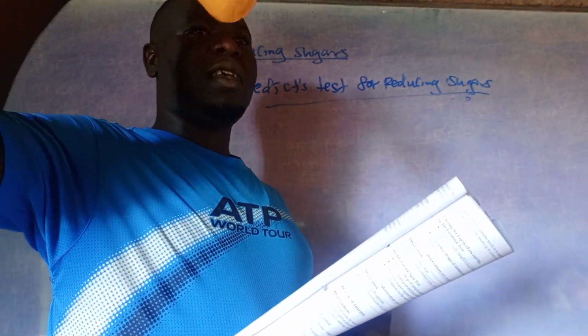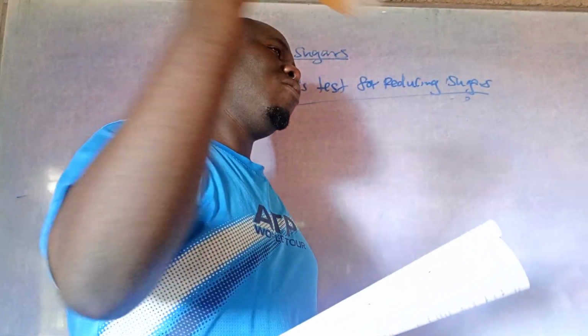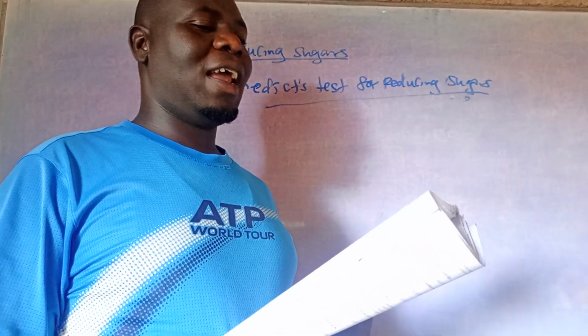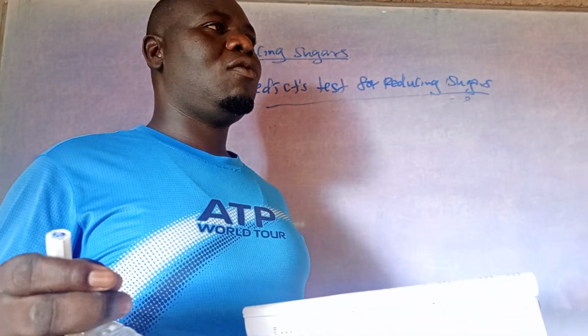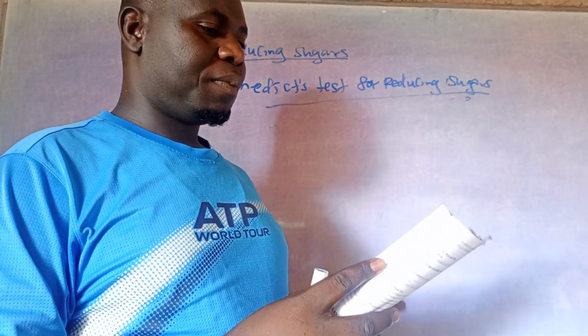So even if the solid is given, one percent of it solid, whatever, you need to try by all means to convert it into liquid by mixing it with distilled water. All together, you grind it. You know grinding. Once you grind them, then mix it with distilled water. Then you filtrate and get the solution.